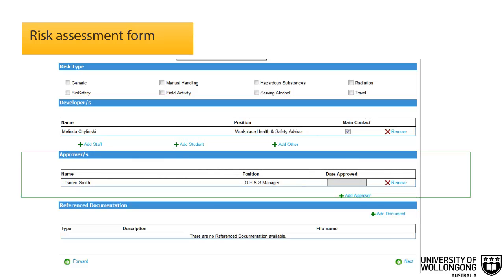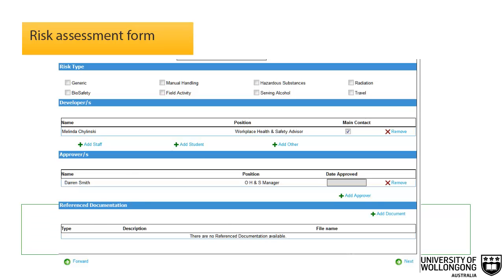In the approvers section, the form automatically populates the supervisor for staff. Students and contractors will need to add their approver manually. Any person who may be required to review and approve the document should also be added to this list. Approvers are restricted to UOW personnel and are able to modify the risk assessment, however any modification should be made in consultation with the developers. To add an approver, click the add approver button. To add reference documentation, click add document. You must enter details of any documentation referenced during the development of the document. Reference documentation should be relevant and appropriate, including any UOW documents, legislation, codes of practice, or Australian standards that relate to the hazards you are assessing.